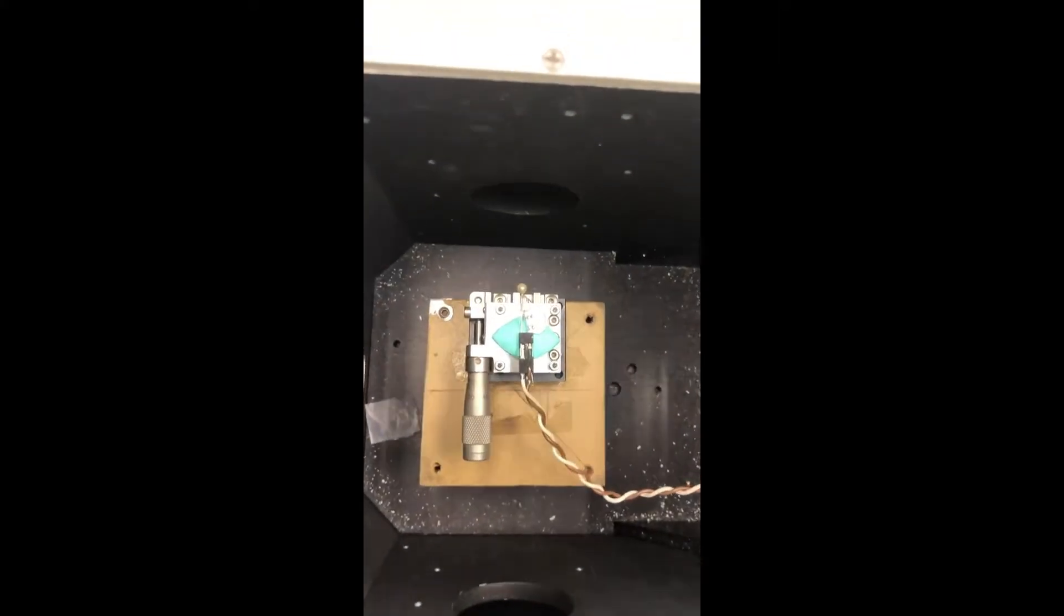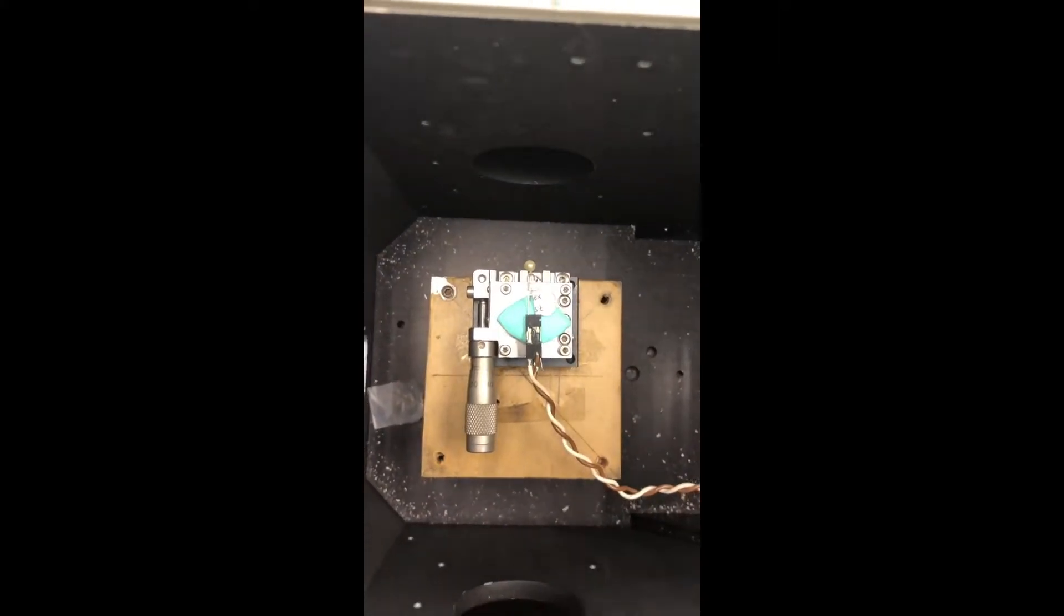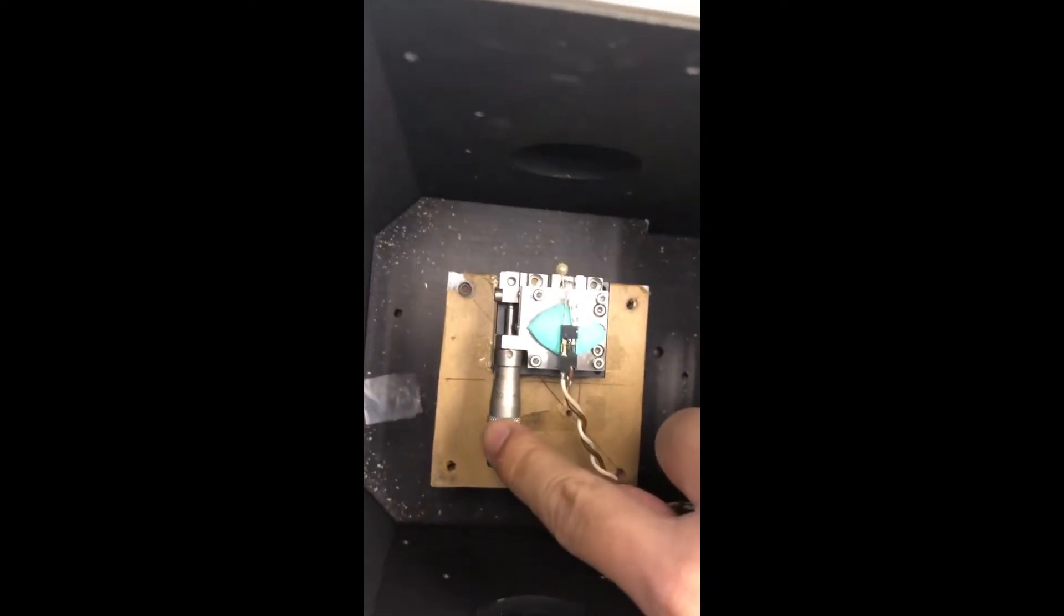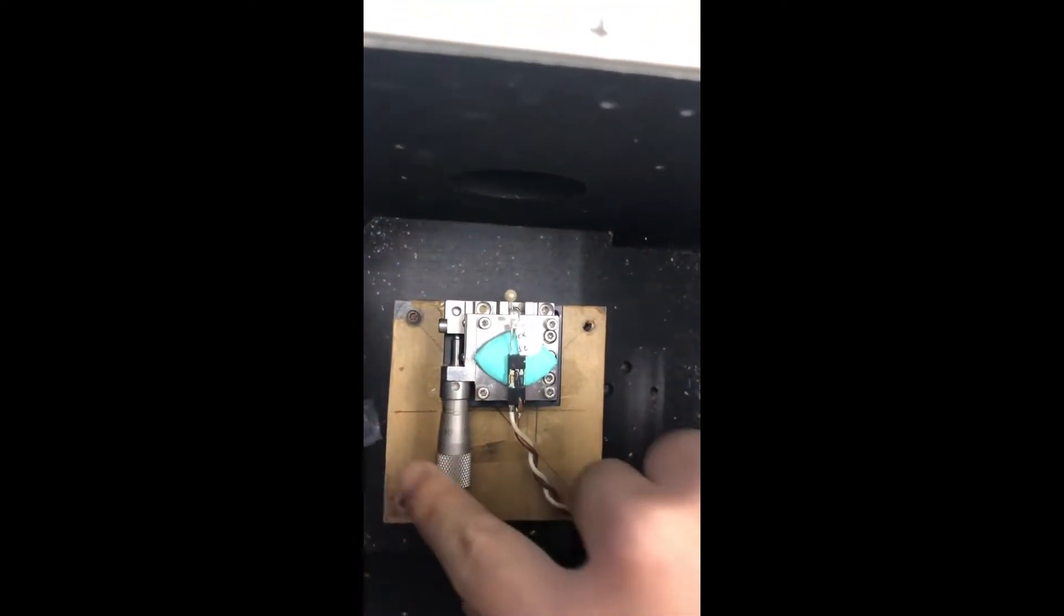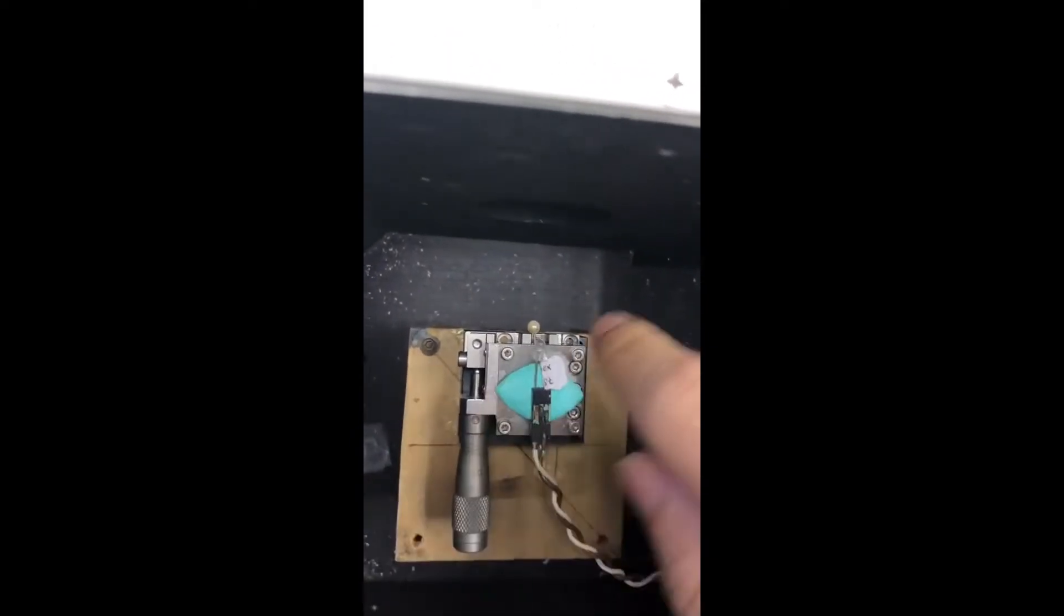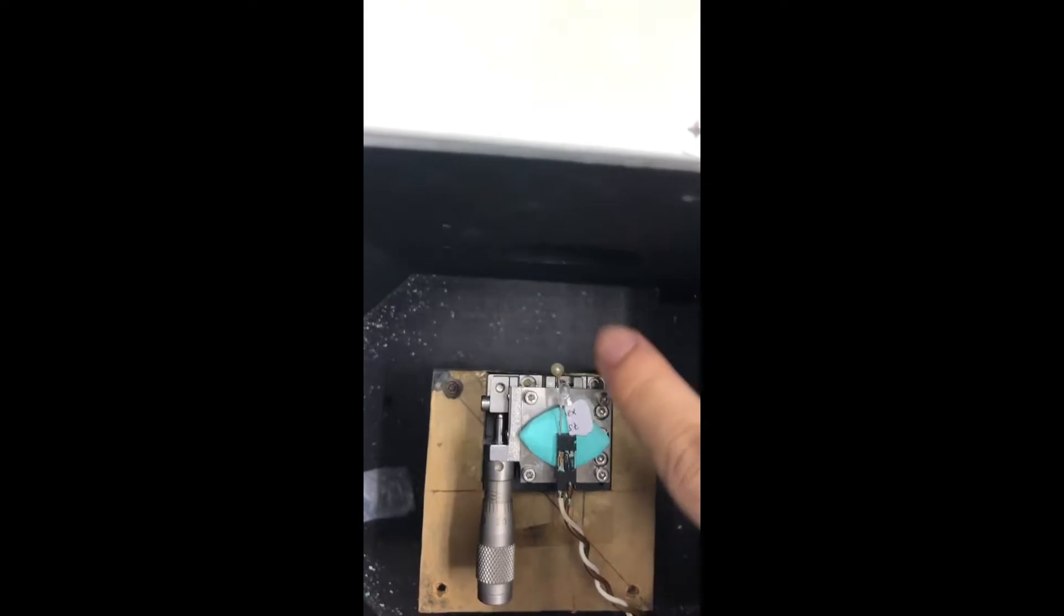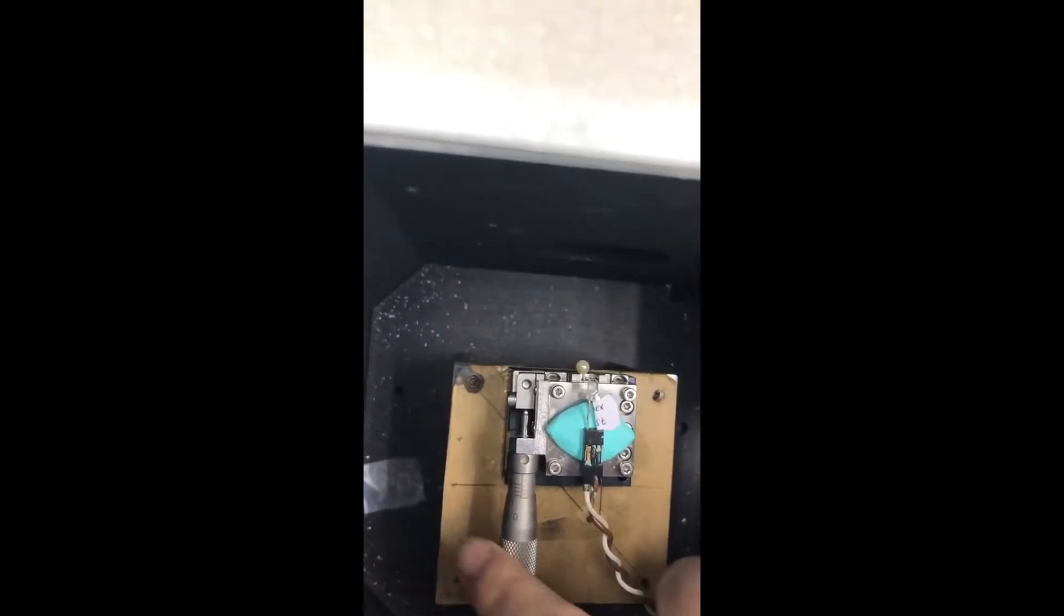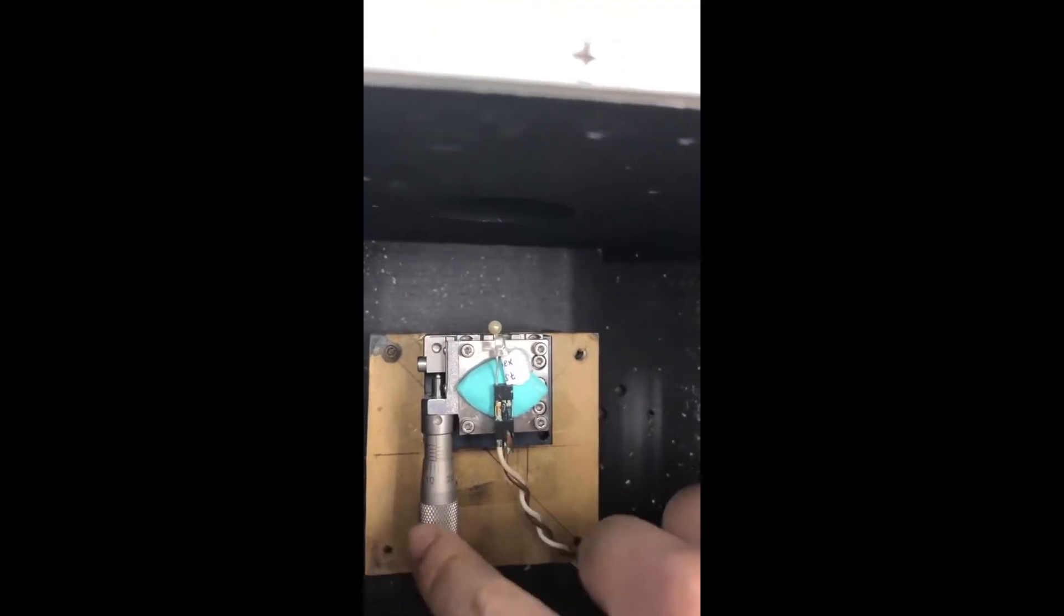Now after connecting the LED right here, as you can see here, these things right here are to adjust the position of the LED. You can either move it closer to the screen right here or move it far away from it. For example, here I put it in the middle.